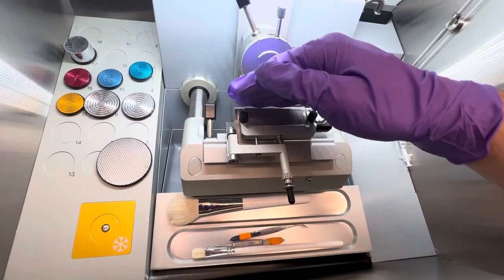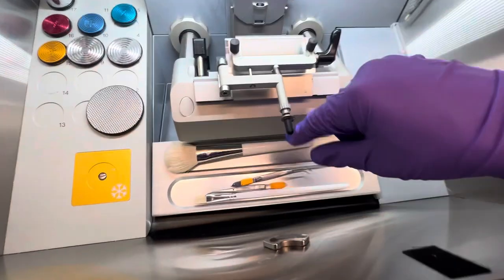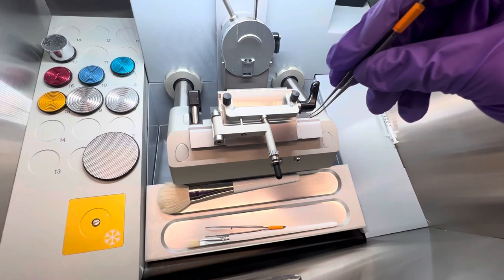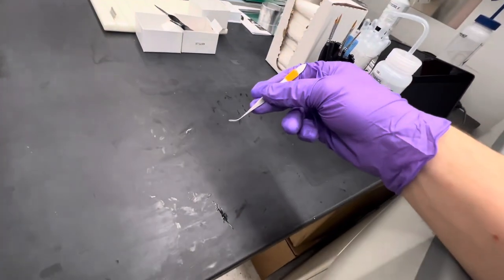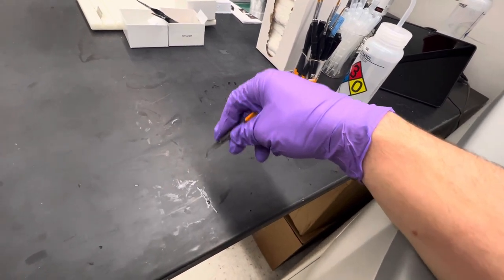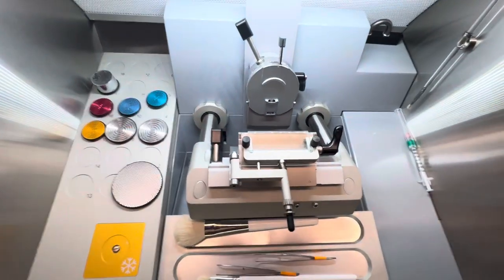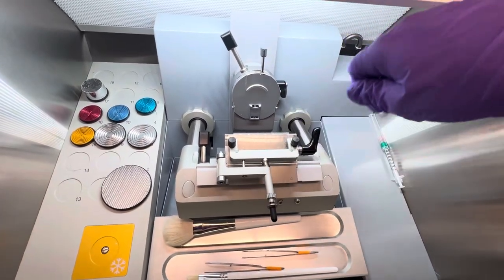But regardless, you take the section off and it'll probably fall either onto the stage or into the waste bin. You'll use the tweezers to very carefully grab it. You don't want to squeeze the tissue and damage it. Just grab it, pick it up, and you'll probably have that 1:8 concentration of PBS to distilled H2O here. Put it in there as your mounting medium and let it dissolve until you get to the tissue. Let it dissolve away with the OCT. So that's the process of going back and forth.